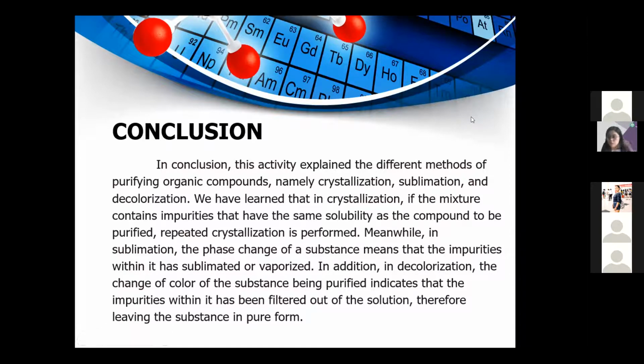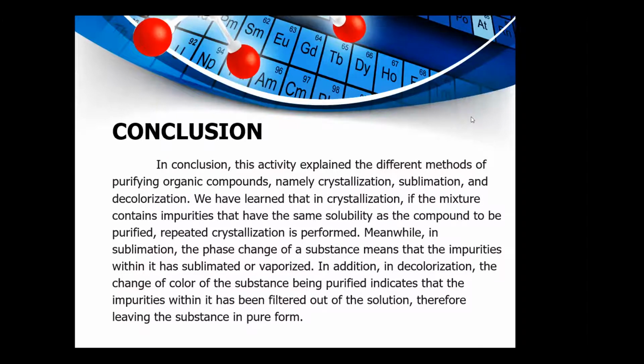In conclusion, this activity explained the different methods of purifying organic compounds, namely crystallization, sublimation, and decolorization. We have learned that in crystallization, if the mixture contains impurities that have the same solubility as the compound to be purified, repeated crystallization is performed.